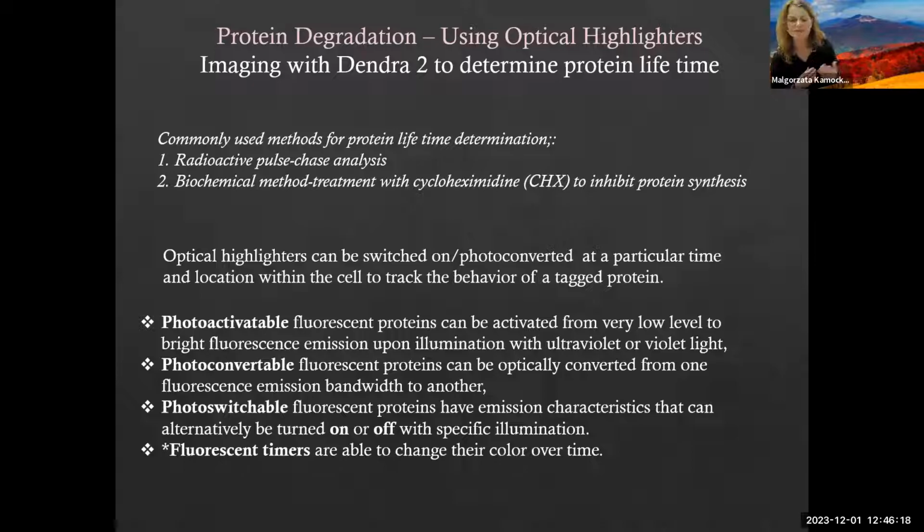And then there were fluorescence techniques like FRAP, fluorescence recovery after photobleaching, where people were trying to bleach the area of interest and then see how the intensity recovers. The only problem is that to bleach the region of interest first, you have to apply high laser power. So the cells are typically not very happy with that, but also there is mobility of proteins within the cell.